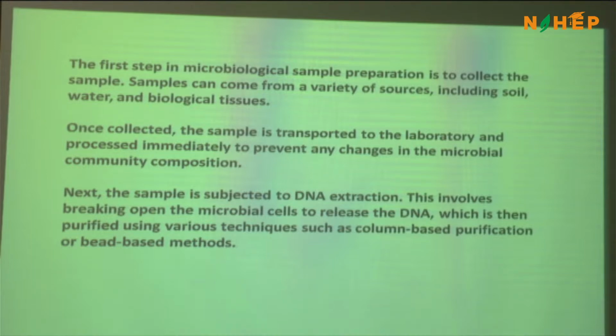So this is a typical workflow. When the sample is collected, keep all these things in your mind. A portion of the sample goes into a metagenome or meta-barcoding analysis. Another portion goes for culturomic or microbiological methods, what are called culture-dependent methods. A third one goes for maybe microscopic analysis, and the fourth one maybe for long-term preservation. And you can add more. Suppose you are doing metatranscriptomics, maybe another sample can go for metatranscriptomics, metaproteomics, and even metabolomics.